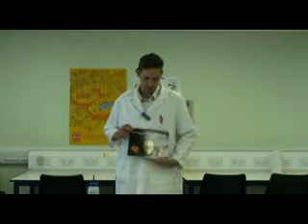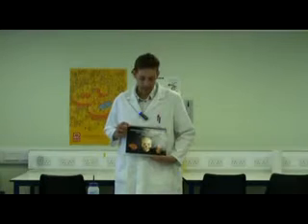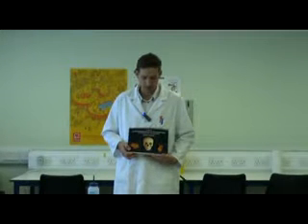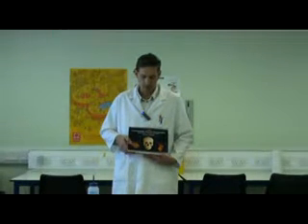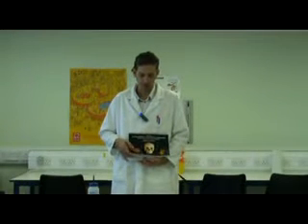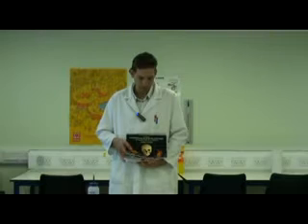The heart is a very specialized organ, and in order to help one look at it and dissect it, one needs some guides, and a very useful guide is a photographic atlas of the body. This is very useful because it has very real images and very nice images in color that one can page through and use as a reference when looking at an organ.